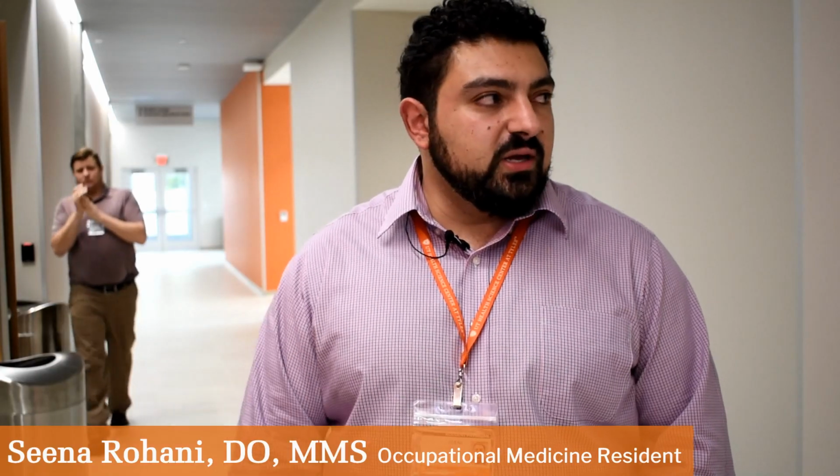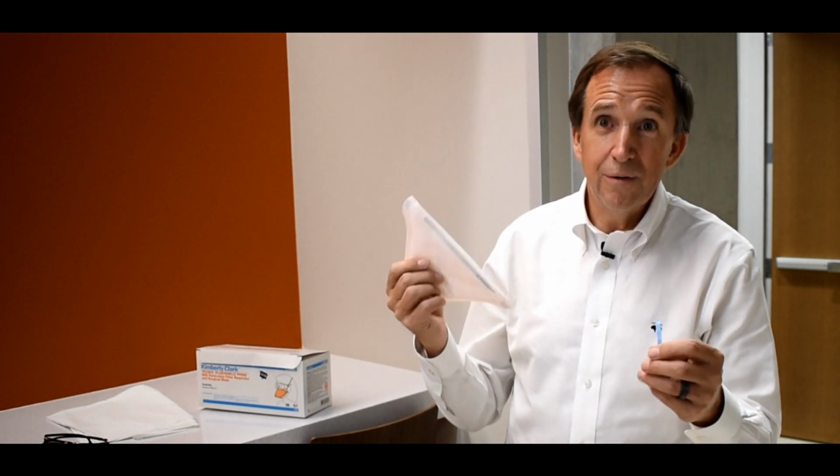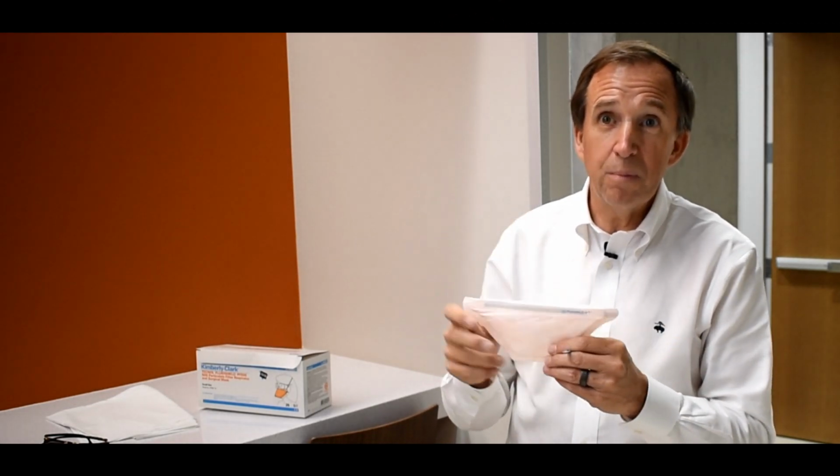And so the fact that we had the access through our residency to the quantitative testing equipment, and to have the mentors that we have, allowed us to really look and make sure that we're taking every possible measure to make sure that this old respirator works just as well as one that would be new. This is the dilemma that's going around across the country, where we all have a stockpile of supplies, and this part is still good.